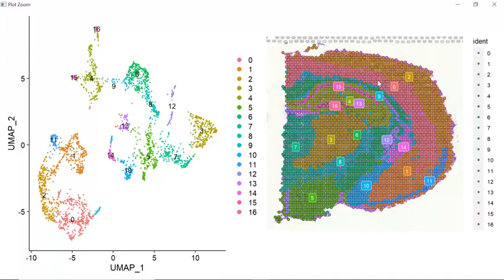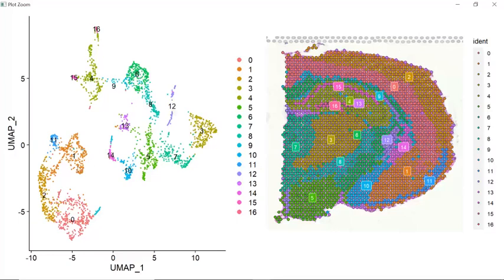Each spot could contain several cells. The spots that contain similar cell types will be clustered into the same cluster.